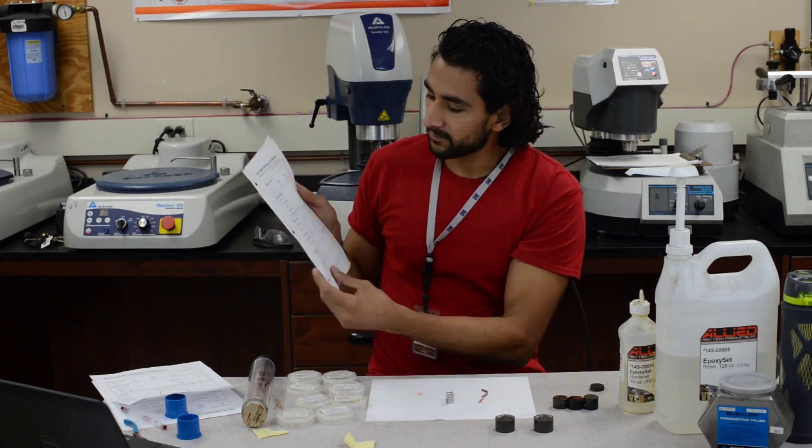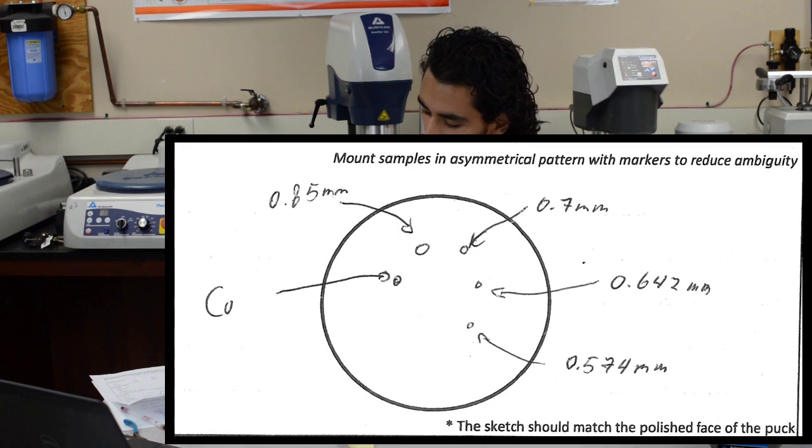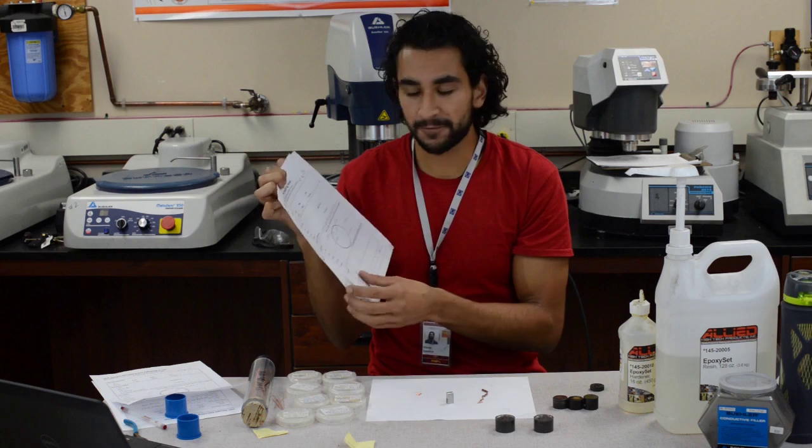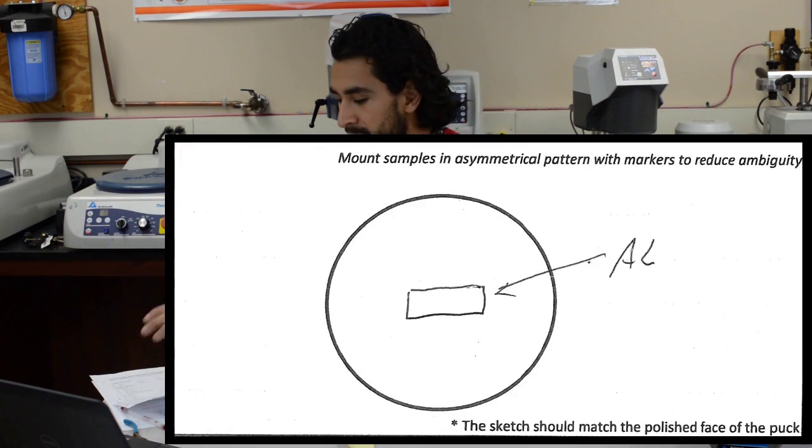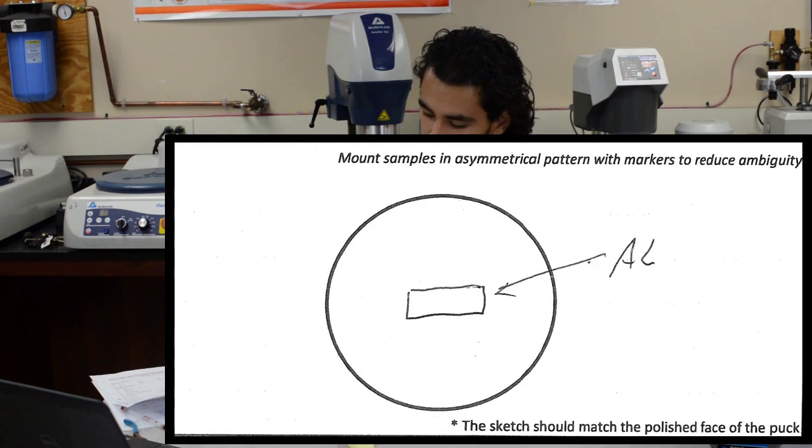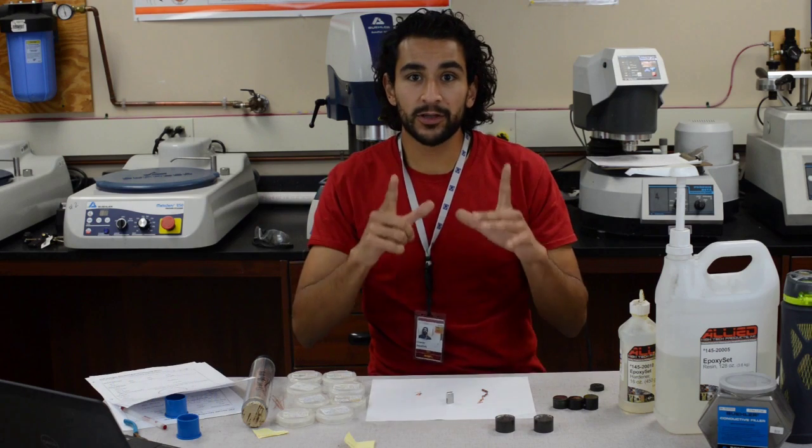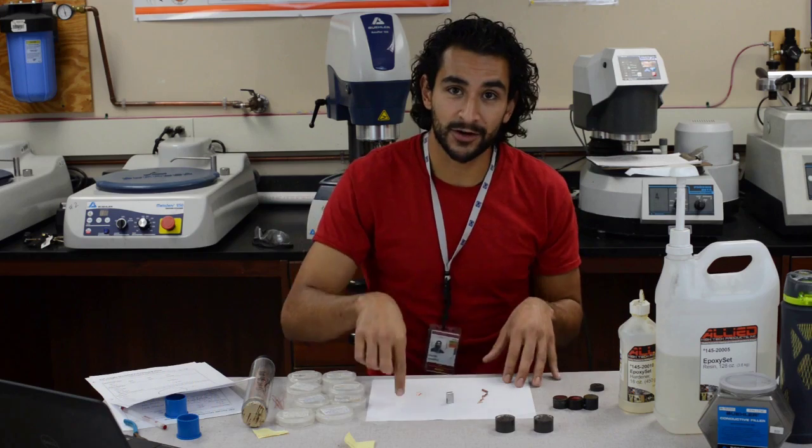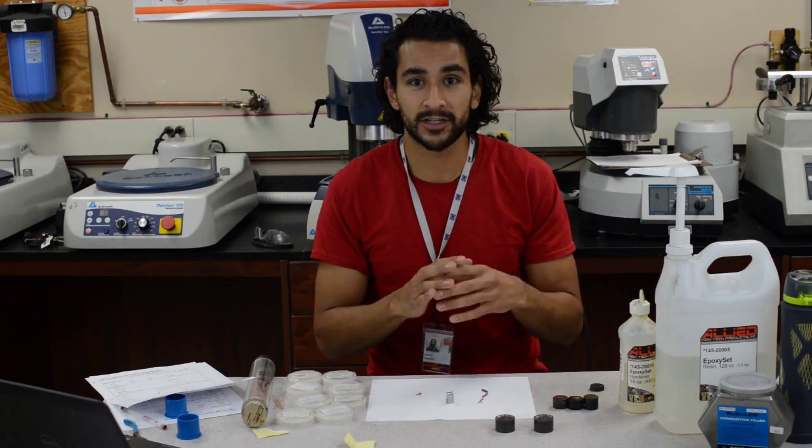And this is the sample 39, and you have four different wires and then a copper marker. In the other one, I also had a copper marker. That's going to tell me, it's going to help me identify each sample. And the aluminum block billet is just an aluminum block right there. So remember these are transverse cross-sections.